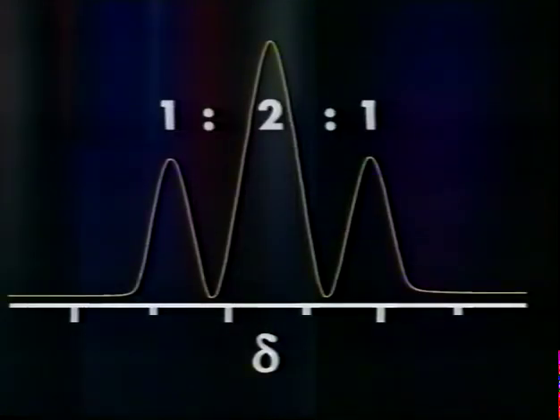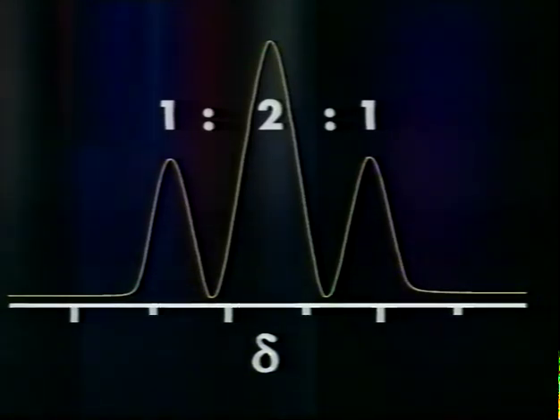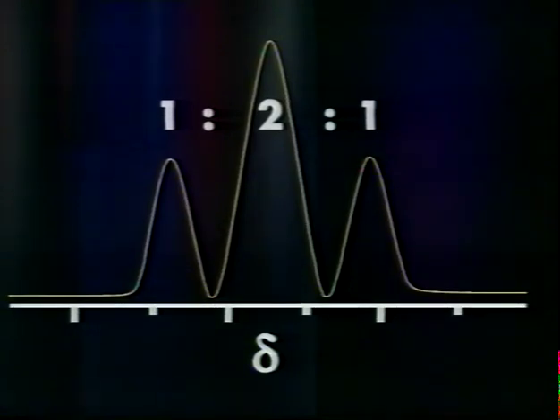If we have spin-spin coupling with two adjacent protons, we have more possibilities. The adjacent protons could both be aligned with our first proton, or they could both be opposed, or one could be aligned with and the other opposed. There are two ways of this happening, but both will create the same effect. So from two adjacent protons, we have three possible effects, and this will show as a 1-2-1 triplet on the spectrum, the center peak having double intensity, representing the two equivalent options.